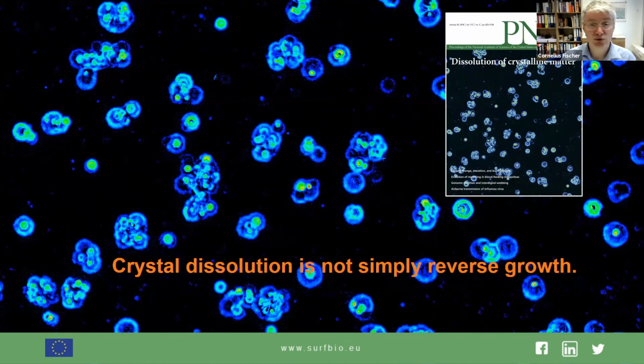There are these black portions where almost nothing happens. There are these tiny little blue colored dots. They refer to a specific defect type. And then we have these other characteristic circles where a major portion of surface reactivity is doing the important work of material release.